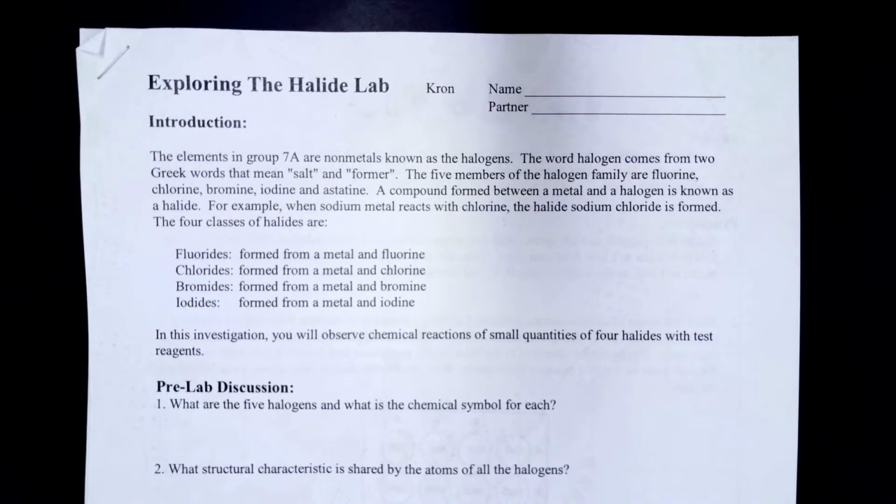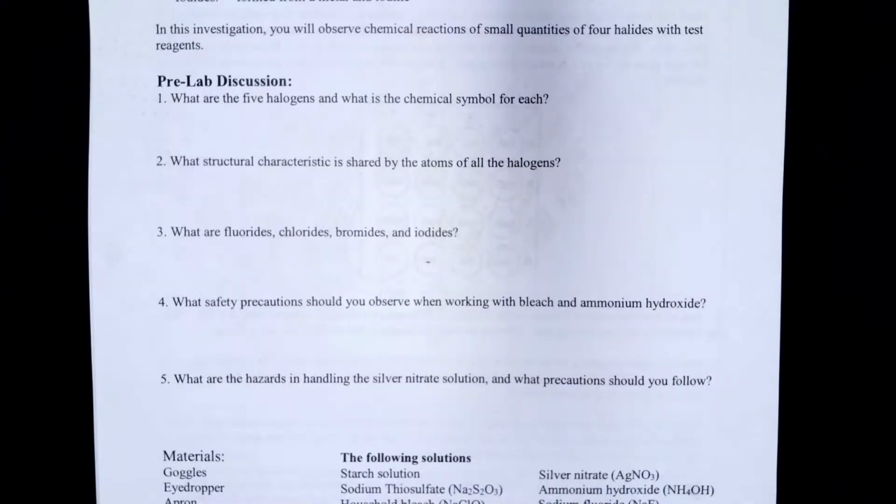So here's the video for the Halide Lab. Make sure you read the top. The first 3 pre-lab questions you can answer with the information on the top here. So the first thing I'm going to have you do is the first 3 pre-lab questions on your own. I'll show you where the halogens are in the video in a second.